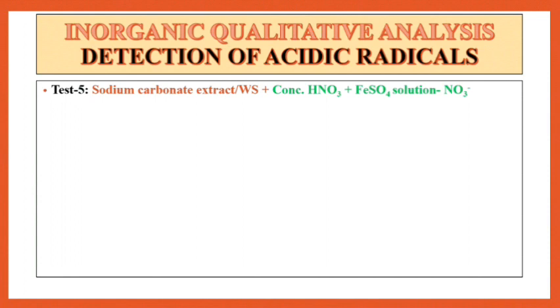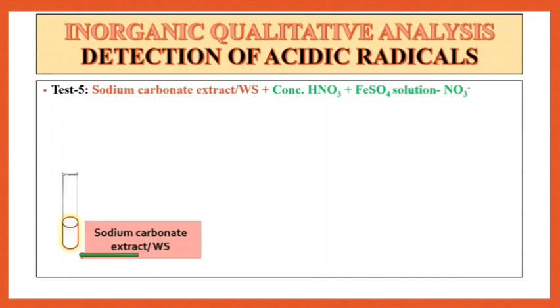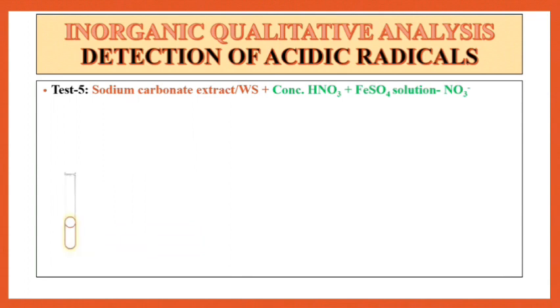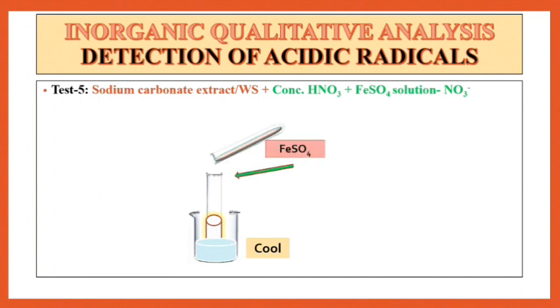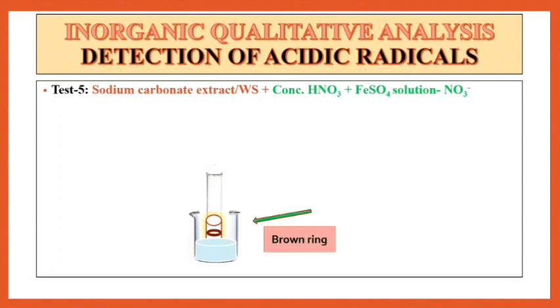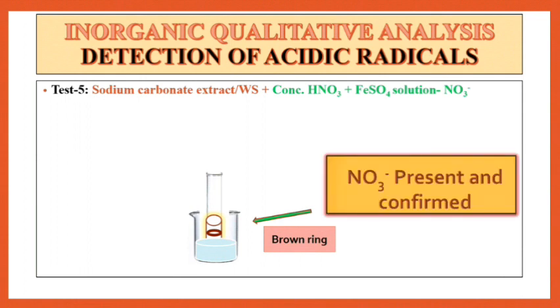Test number 5 is for the detection of NO3⁻. For that, take sodium carbonate extract or water solution. To this solution, add concentrated H2SO4 drop wise and shake this solution well. After the addition, place this test tube in a water-containing beaker for cooling. Then add freshly prepared FeSO4 solution drop wise from the side of the test tube. A brown ring will develop at the junction of these two solutions. So NO3⁻ is present and confirmed.